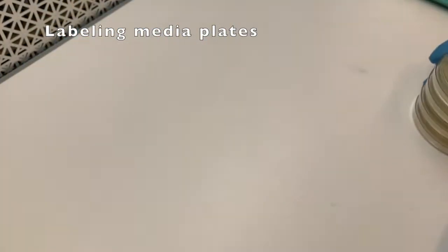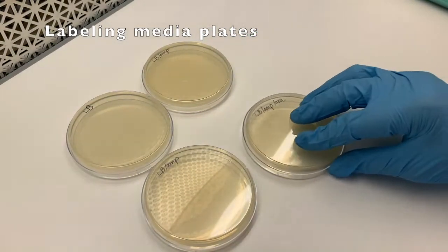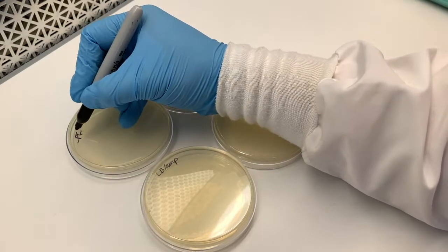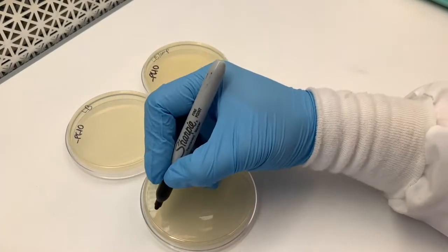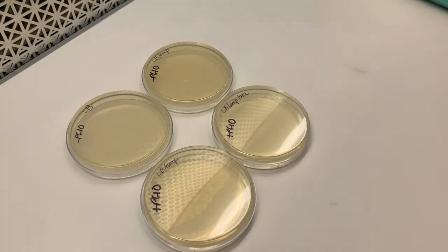At this point there are several other steps in between, but one important note is that you want to carefully label your plates as laid out here. Label always on the back of the plate. The reason is that the back of the plate stays with the nutrient agar, so there's no way to confuse them — if you were to label the lid, they could get mixed up. Also make sure to include your group name and the date.